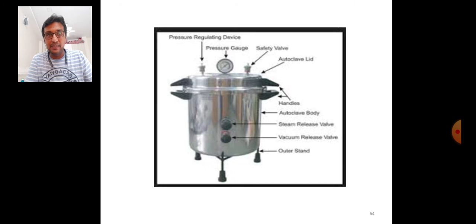It is an upright cylindrical vessel which is having the lid, closing lid from the top side. वरून त्याच्या एक कव्हर आहे जे ऑटोक्लेवच्या वेसलला क्लोज करण्यासाठी कामात येतंय. Then from the upper side of this particular closing lid there are the two valves. दोन valve आहेत तिथे. तुम्ही जर बघाल ज्या प्रकारे कुकरवर एक विसल असते त्याच प्रकारे इथे ऑटोक्लेवच्या डिव्हाइसवर किंवा त्याच्या कव्हरिंगच्या सरफेसवर तुम्ही जर बघाल तर दोन विसल्स किंवा दोन वॉल्व्स इथे दाखवलेले आहेत या फिगरमध्ये. And one more thing is there, that is the pressure gauge. प्रेशर गॉज इज बेसिकली यूज्ड टू इंडिकेट द प्रेशर विच वॉज गेट जनरेटेड इनसाइड द वेसल.